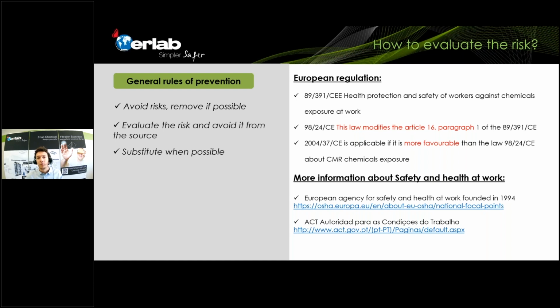Substitute when possible. That's also very important. If you can use a product which is less harmful for the user, for the people in the lab, replace it, as simply as that. So for example, CMR products, if you can replace them by another chemical which will react in the same way, then that's a good thing to do.